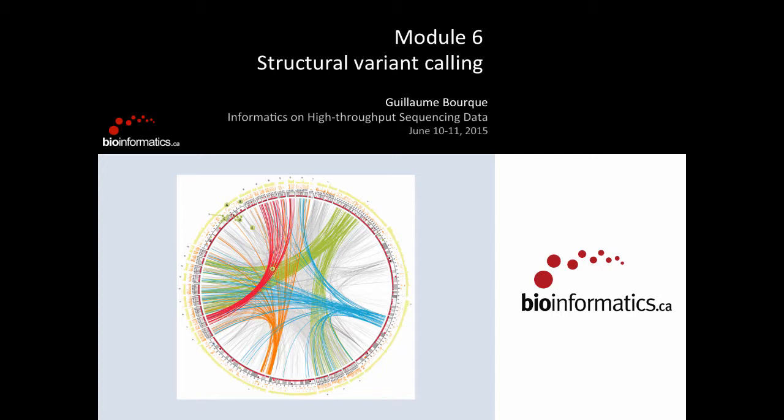So that's something to keep in mind. You can also do variant calling in this context, but you have to tell the variant caller that you're not expecting a diploid genome, which is basically the parameters that we were using in the lab before. So you can do it, there's no question, but the variant calling part itself would be slightly different. So we talked about small variant calling, indels, but very small indels.